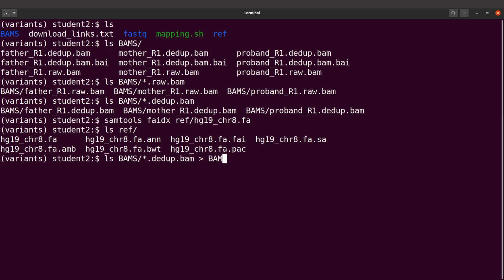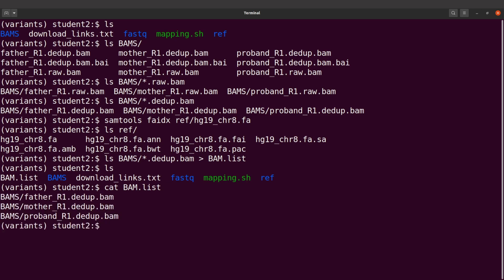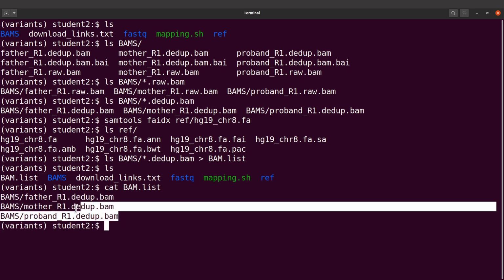So I'll say bam.list. So now if I do an ls, I'm going to find the bam.list file here, and then I'll say cat bam.list to display the contents. So I have them here.